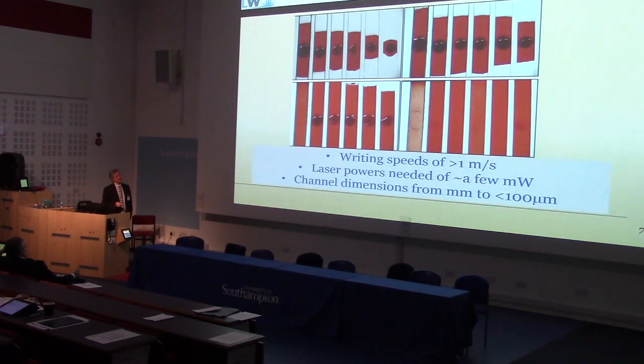Okay, so we're using lasers to pattern paper. By paper I really mean membranes, like nitrocellulose, cellulose, a range of other things. A laser beam scans down here very quickly and polymerizes in the paper an impermeable wall. And that wall is then fixed and firm, and liquids you put on here, drops of liquids, will then flow down the separate channels and won't mix. So you could do, in this case, 6 tests in one, provided you've got the biochemistry on the far end to give the colour change.